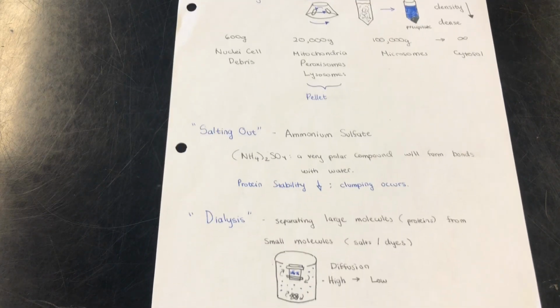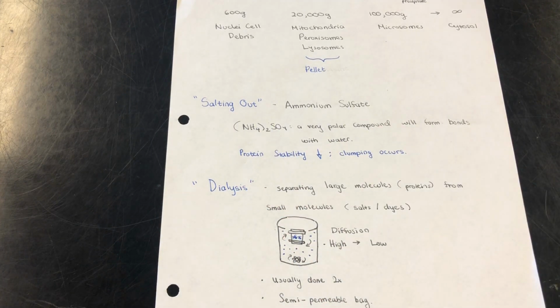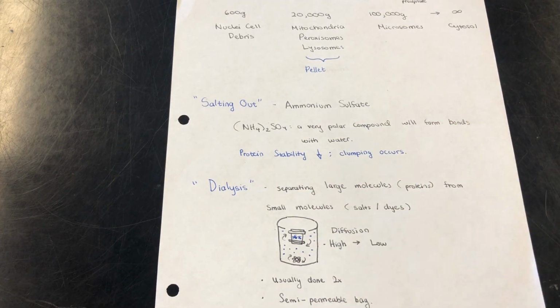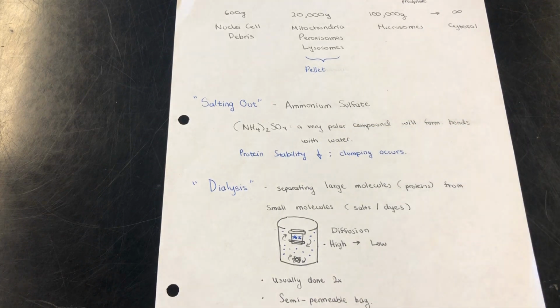So moving to the next step, once you have it separated, you're going to want to proceed with salting out. Using ammonium sulfate, a very polar compound, this polar compound will bond with water and will prevent the protein or enzyme from bonding to water, decreasing its stability and allowing it to bond to itself, which you will see as some form of clumping.